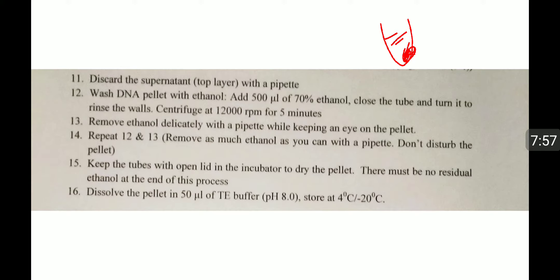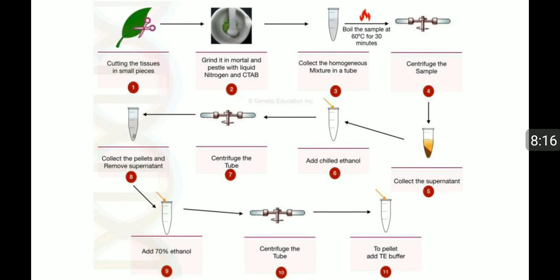Remove as much ethanol as you can with a pipette. Don't disturb the pellet. Keep the tubes with open lid in the incubator to dry the pellet. There must be no residual ethanol at the end of this process. Dissolve the pellet in 50 microliters of TE buffer and store at 4 degrees Celsius or minus 20 degrees Celsius.